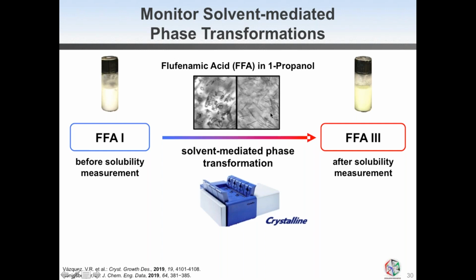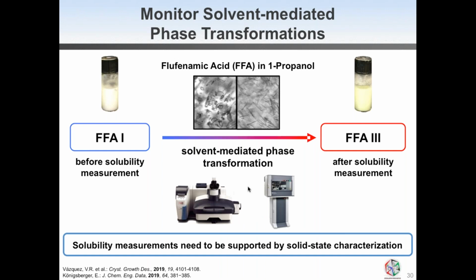And again, the beauty with flufenamic acid is that we can clearly distinguish it based on color, just looking at the vials at the end. So therefore, besides in situ monitoring features, we always recommend to also use solid state characterization techniques like powder X-ray diffraction or Raman spectroscopy for offline measurement.